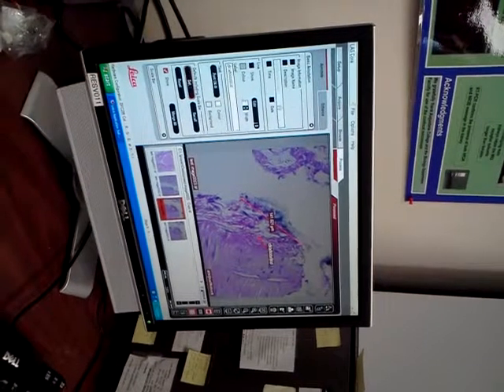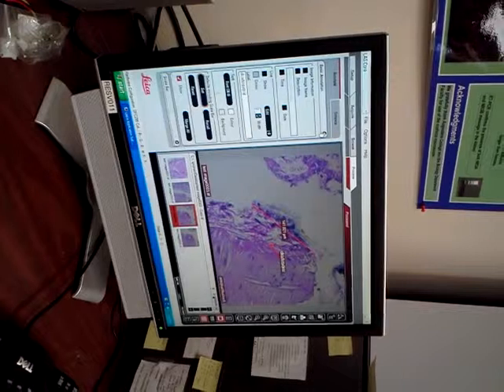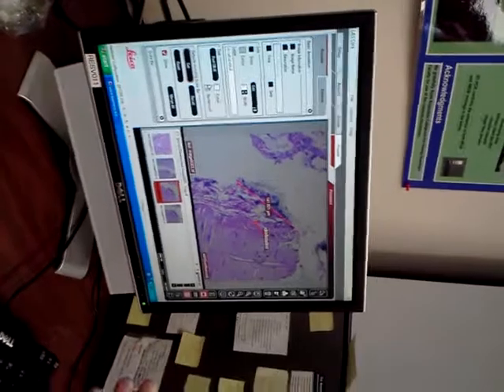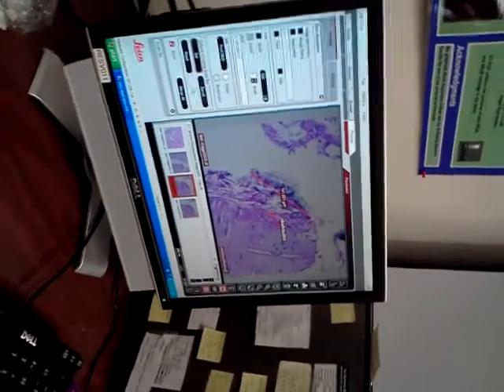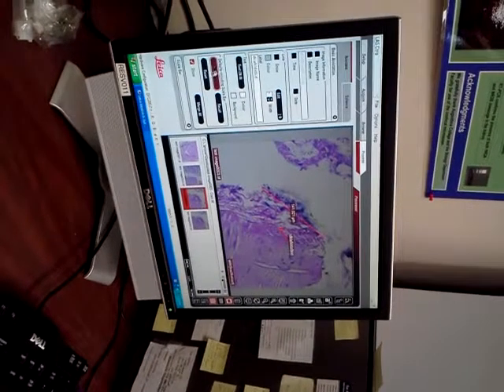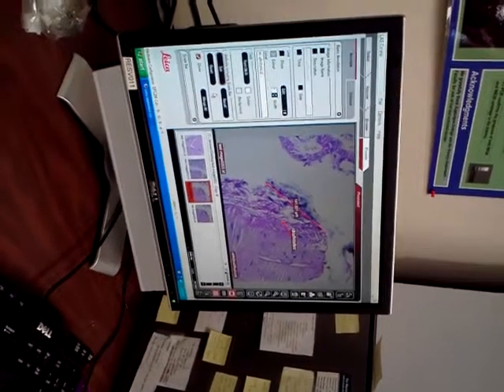That will save it for just that image. It will save both your annotation and your scale bar information. It's basically saving what you just did, changing the font and the color and the width, even for the next person that comes in. So when you come back into the software, rather than changing the font and the color again, you just click on recall, and it'll recall the previously set defaults. Too bad we can't have 5 different settings. That's not that big a deal.